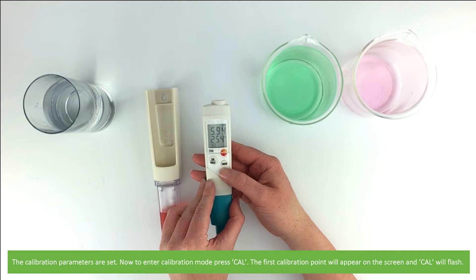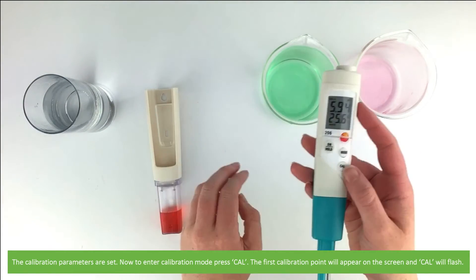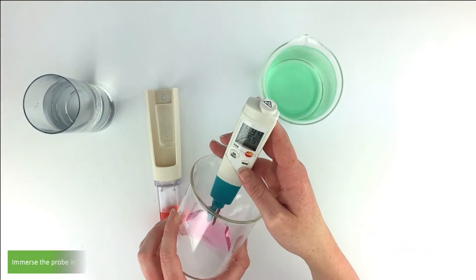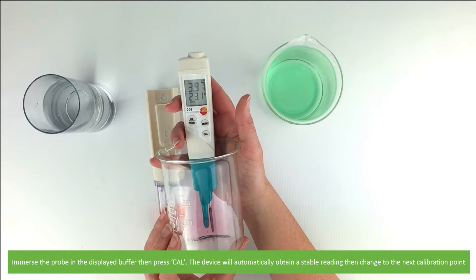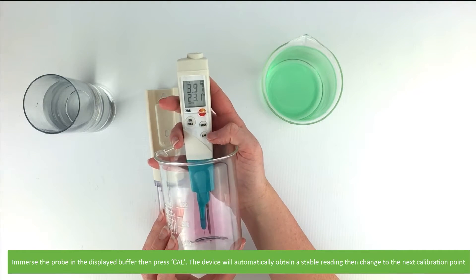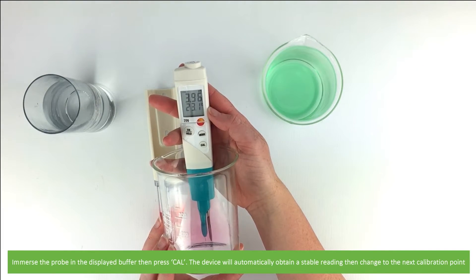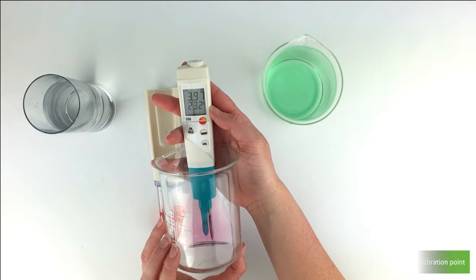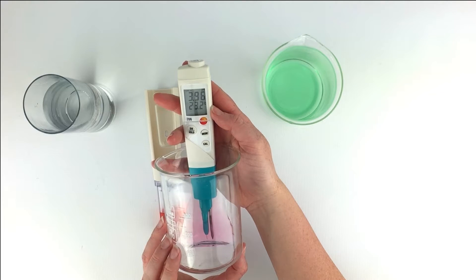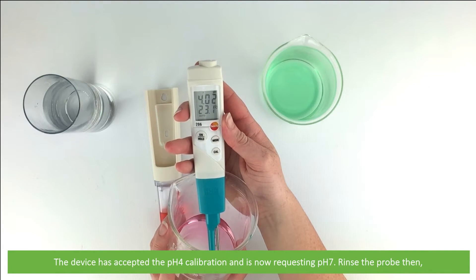The calibration parameters are set. Now to enter calibration mode, press cal. The first calibration point will appear on the screen and cal will flash. Immerse the probe in the displayed buffer and then press the cal button. The device will automatically obtain a stable reading then change to the next calibration point. The device has accepted the pH 4 calibration and is now requesting pH 7.